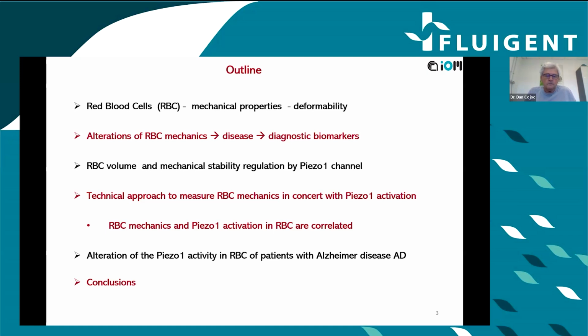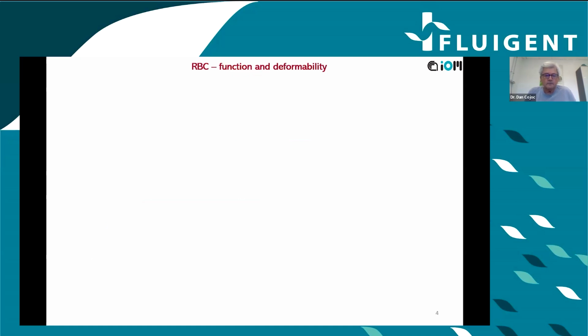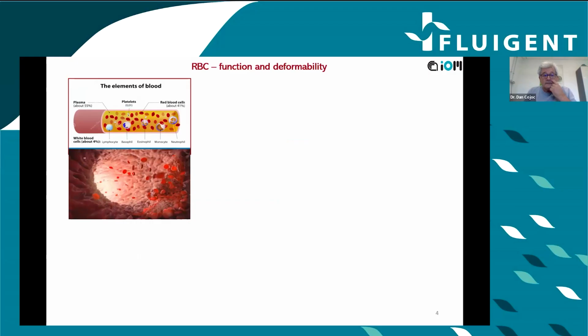And I will show that red blood cell mechanics and Piezo-1 activation are correlated. Then I will discuss a recent application showing that the alteration of Piezo-1 activity in red blood cells of patients with Alzheimer's disease alters the red blood cells in terms of Piezo-1 activation. And finally, the conclusions.